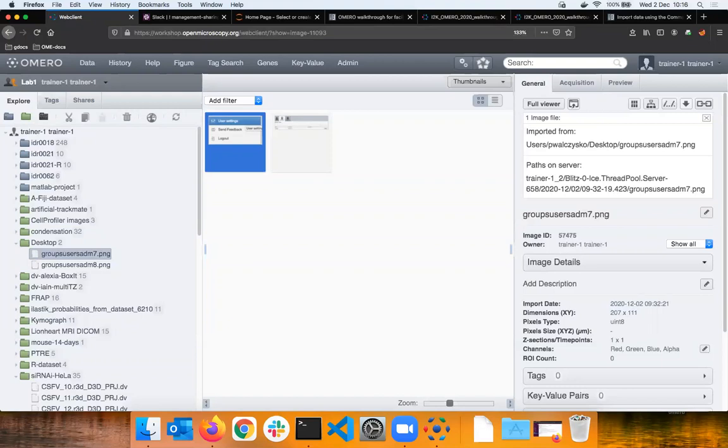So we have been working on that to readjust the metadata. In your case, let's say some metadata were misread during the process because there was a bug in the library. Then we have worked on allowing you to keep the imported image in OMERO and read that image again and fix the metadata that were wrongly imported.